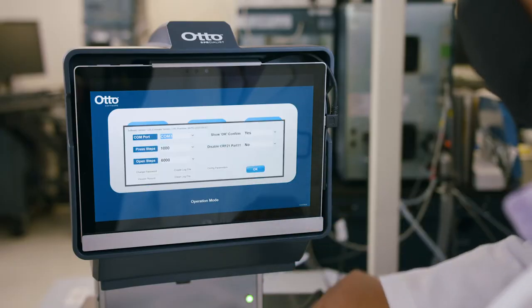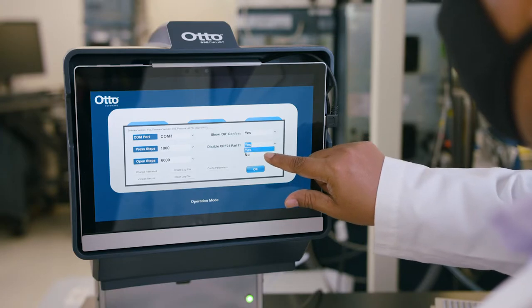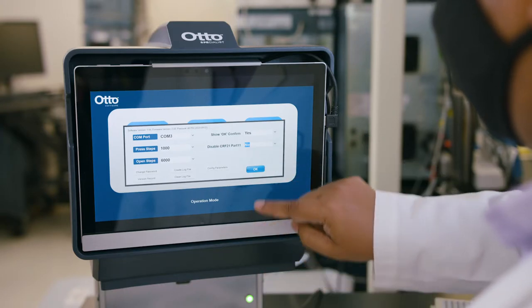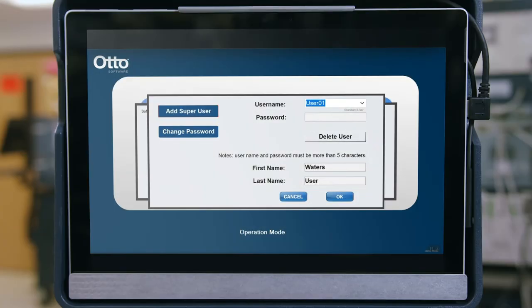You will find three user levels with varying capabilities. Waters Field Service Engineers have their own user level for installation and maintenance, which is password protected. The next level, Administrator, can create new profiles and methods or edit existing ones, create new users, and run profiles and methods. Only the Administrator can enable or disable CFR Part 11 compliance in settings. The last level, User, can run existing profiles and methods.